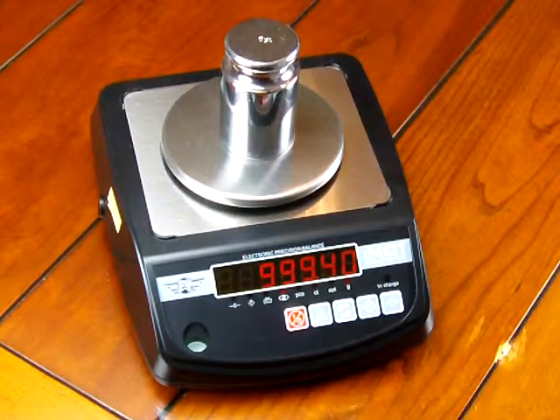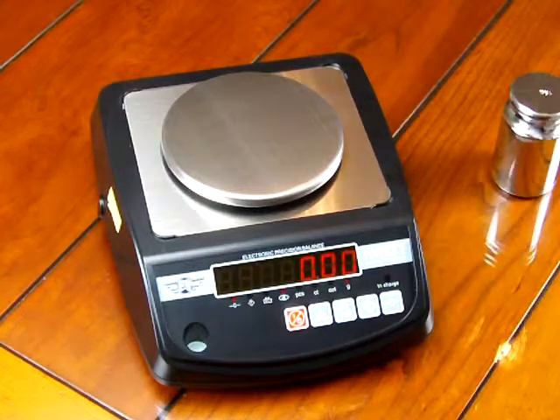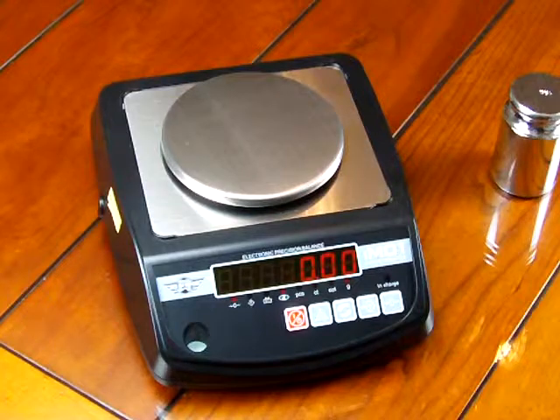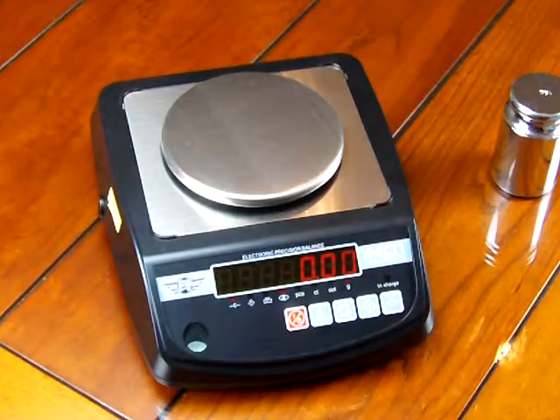You can see that the scale is off and we're just going to go through the calibration. This scale calibration is really, really simple and we'll walk through that. The scale also has a spirit bubble in the front. It also has four adjustable feet and I'll lift the scale up in a minute and show you that.